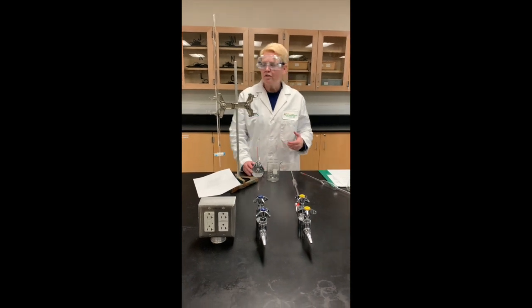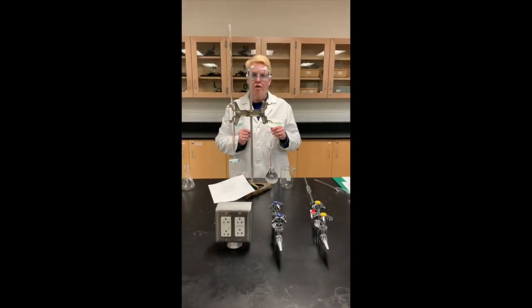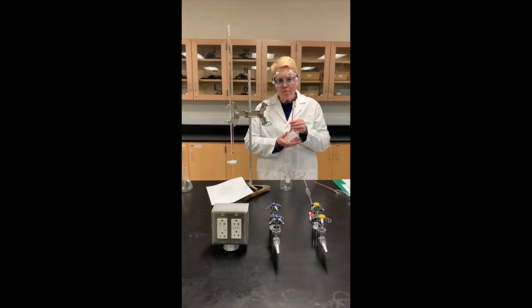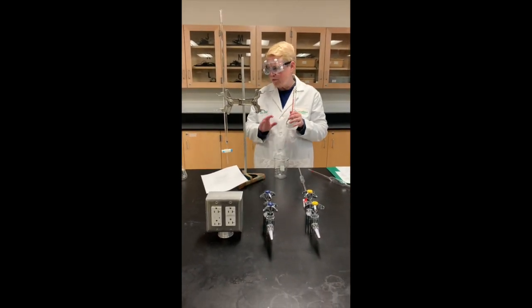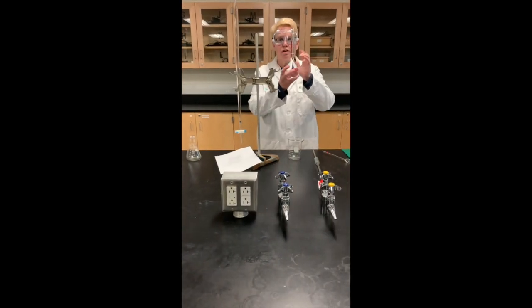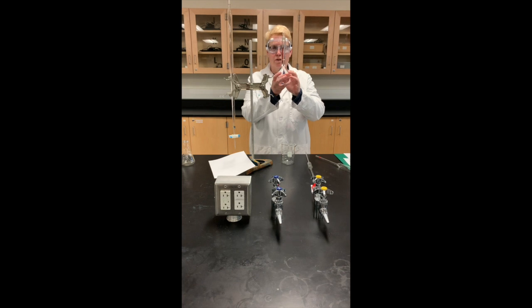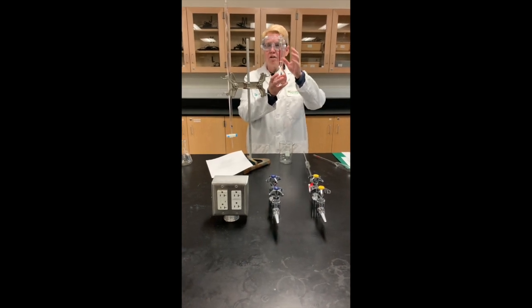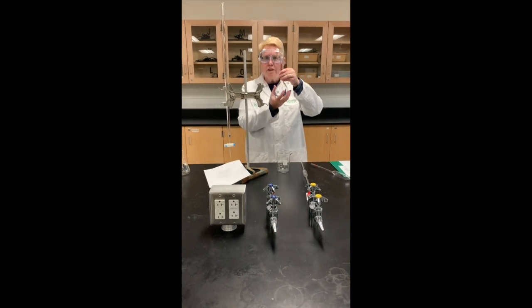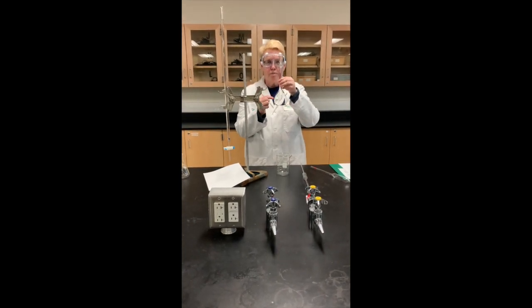Okay, so now we're going to find out the exact molarity of our EDTA, and this is what's called standardization. So we're going to use that calcium solution that we made. Now remember, when you did this, you weighed out the 0.3611 grams and put it in a 250 milliliter volumetric. So when you calculate this, you can calculate the moles of calcium, and then you can go ahead and find the molarity of this solution in the 250 milliliters.